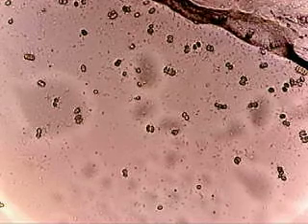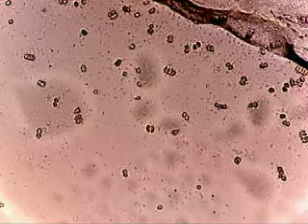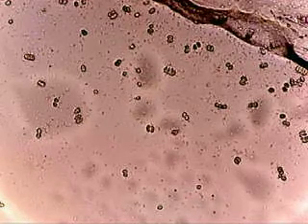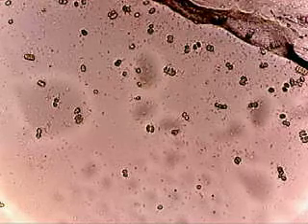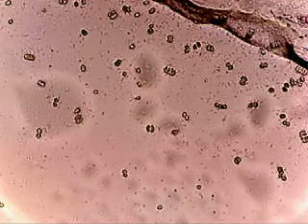Now, breaking this down for you, this particular slide was a drop of that fountain water placed into a sealed wet mount with a little teeny bit of yeast. That was bread yeast, I think, if I recall correctly. I just wanted to see what would happen in a mixed environment. Interestingly enough, the yeast grew a little bit and then quit, which I kind of expected because it had no food source to speak of.